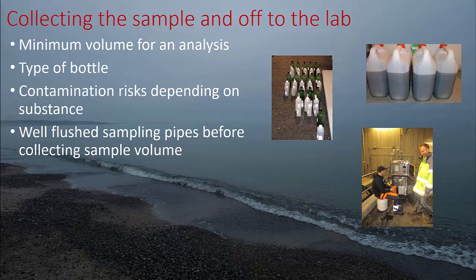Sometimes you have to change hoses to a sampler after each sample. Some very specific times, but very uncommon, but it could be. But basically, with standard equipment, for automatic samplers always check the flush times. Also check the hoses going down to the sample, so they haven't been growing in them or been contaminated in some way.